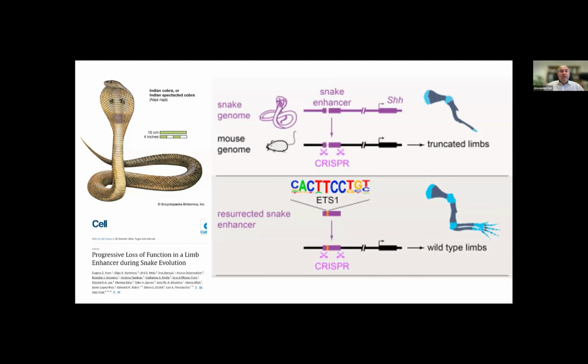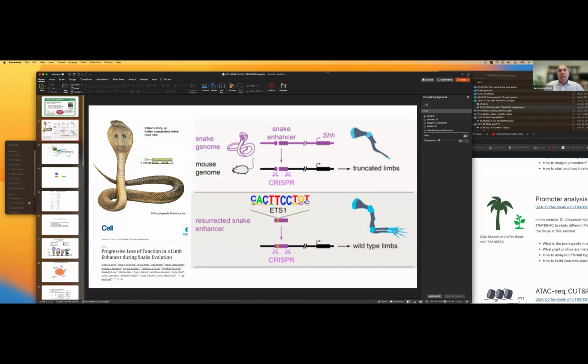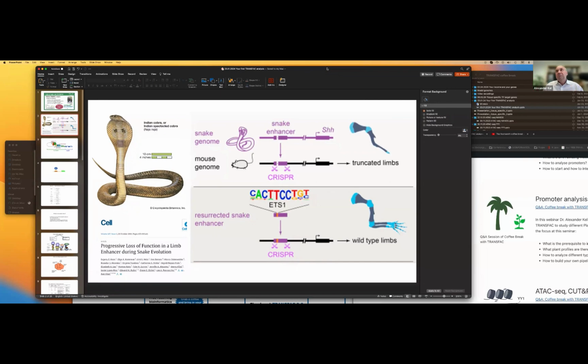But before we go into more details about the theory of how we do that and why, what the algorithm is, and how to apply it, let me first go to the tool we have, to TRANSFAC, and start from scratch. Basically you have your tool, and let's do the first TRANSFAC analysis.